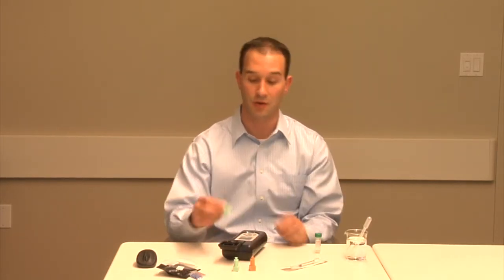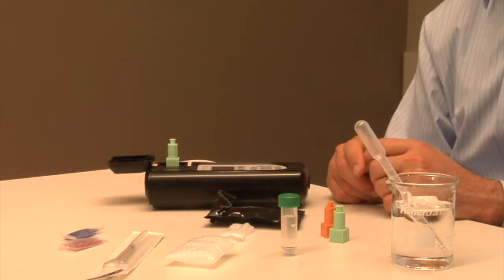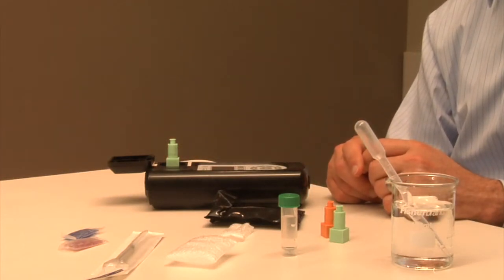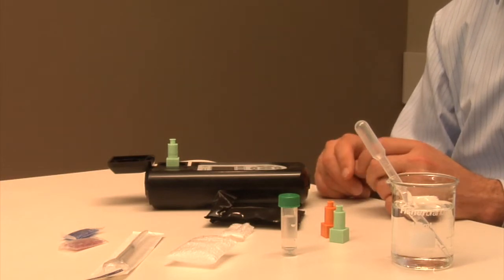The cuvette has an arrow which should face you when inserted. Insert the cuvette completely so that the fluorimeter lid can close. The meter and cuvette design help to prevent improper orientation. Then place the colored sensor on the cuvette. The square portion of the sensor can be placed on the cuvette in any orientation with the round sections facing upward. Make sure the sensor is seated securely on the cuvette.